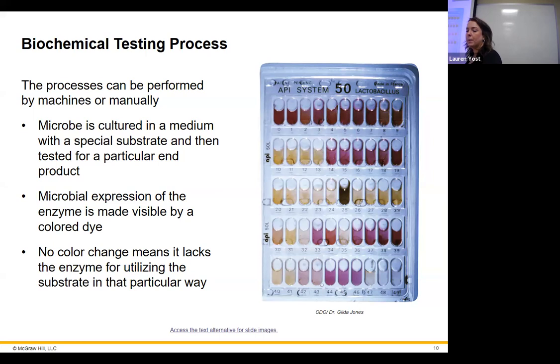For example, I'm going to assume that we don't have our media today. I haven't gone in the lab yet, but I'm assuming we still don't have it. If we did, we would have 4 phenol red carbohydrate fermentation tubes for 4 different carbs. We would have MRVP media, which we can do two different tests with, and then litmus milk. So that's 4, 1, 1. That's 6 for the gram positive and 6 for the gram negative, so 12 tubes. It's not unusual for us to be inoculating that many tubes every single day for the rest of the lab.